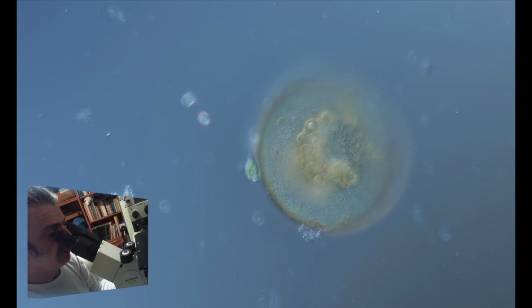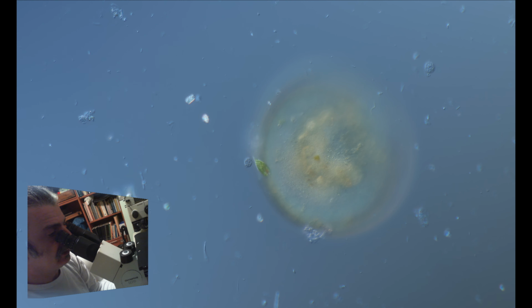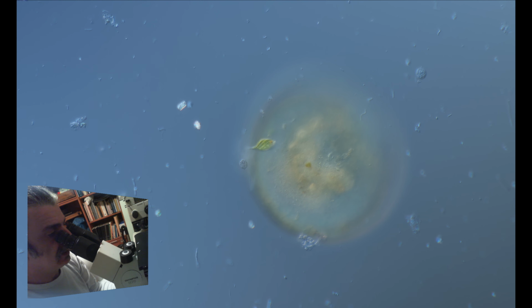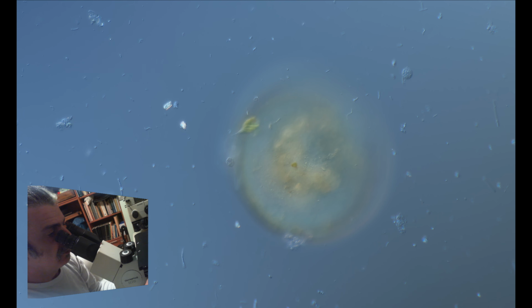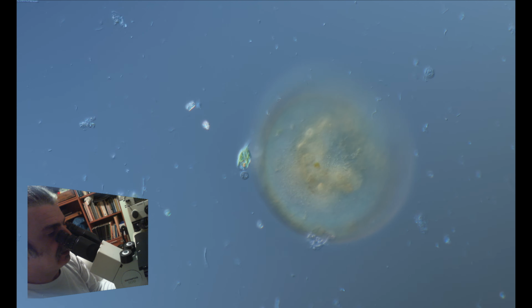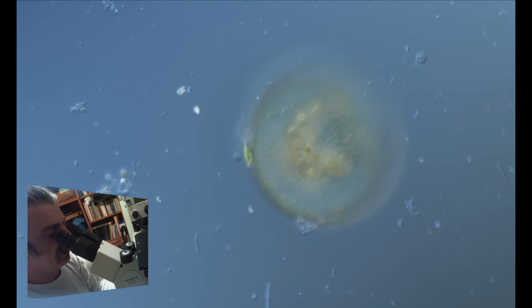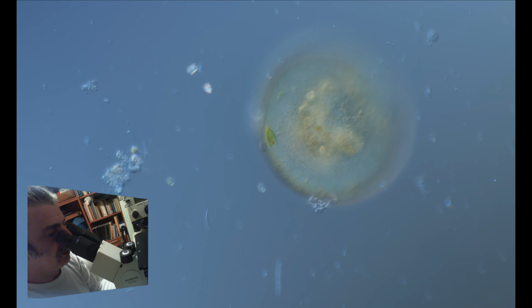And right beside it, we can see a little euglenid, which is an algae, and that red spot that we can observe is the so-called eye or stigma. It's not a developed eye, it only helps it to discern luminosity levels, black and white.